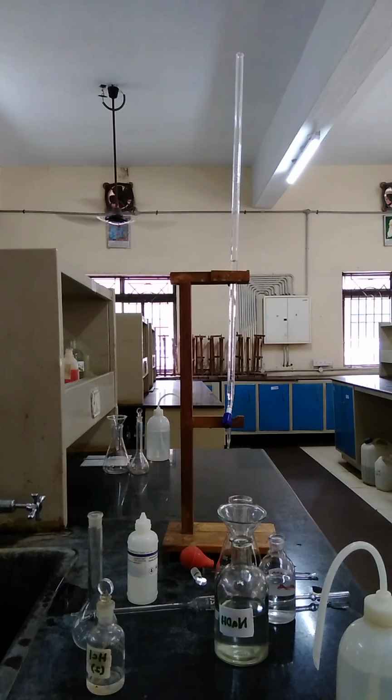The bottles have different numbers, it may be from 1 to 27, as per the strength. They will give bottles 1 to 27 with different normalities, even changing the fourth decimal, sometimes the third decimal, so not too much variation.